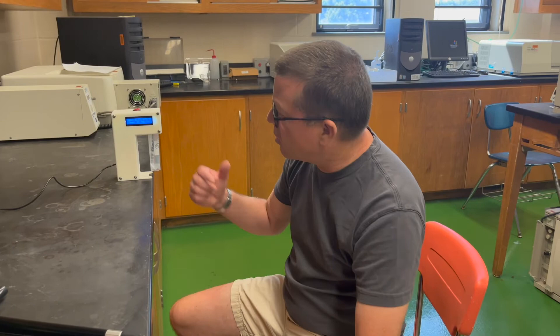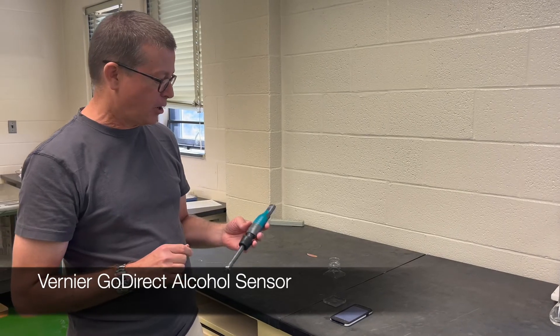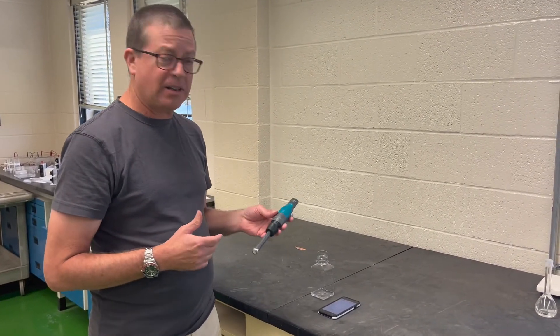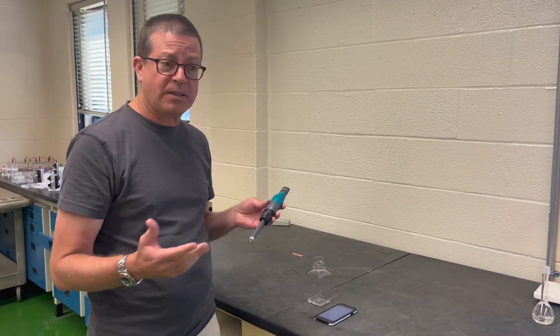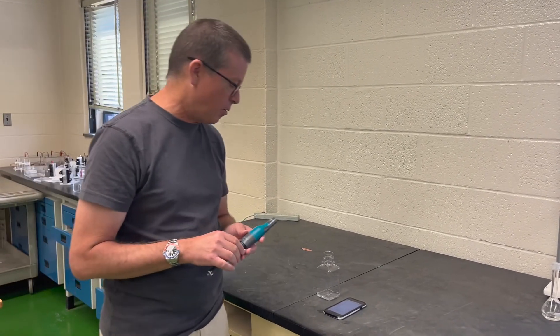That's how the Rare Combinations sensor works — again, highly recommended. Next I'd like to show you the Vernier Go Direct alcohol sensor. This is a really nice little unit. As we said, it's the least expensive option, and you can pick it up for about $165 with everything you need to get going.